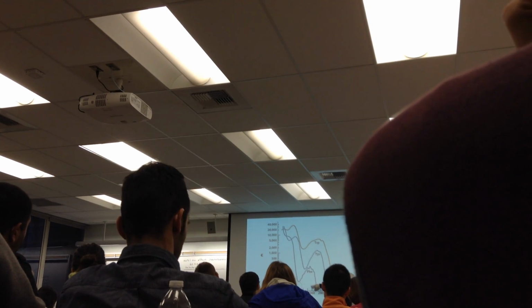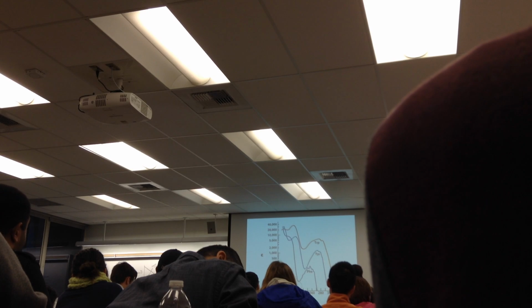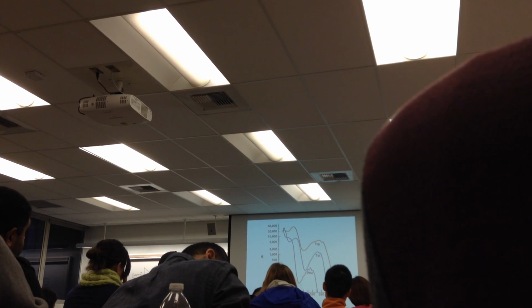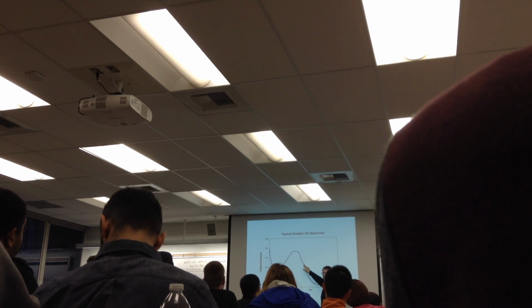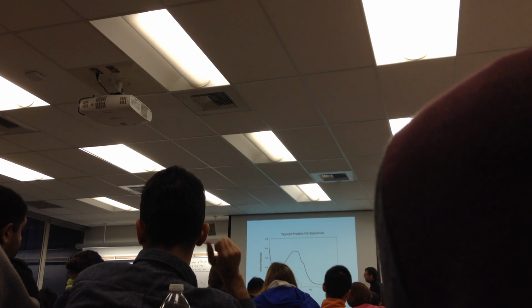Phenylalanine has a peak a little bit closer to 260. Tyrosine is around 280. Tryptophan is a little bit redshifted relative to tyrosine. If you have a protein that has 100 or 200 amino acids, it's likely to have at least half a dozen of these. So the total UV spectrum looks like this. Here's our peak at 280. This little hump here is known as the tryptophan shoulder, because that tryptophan is slightly red shifted. So that little extra is due to the tryptophan in particular.